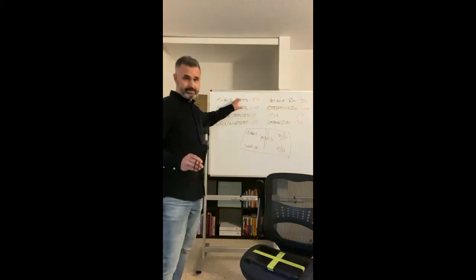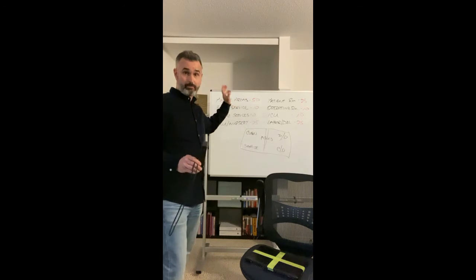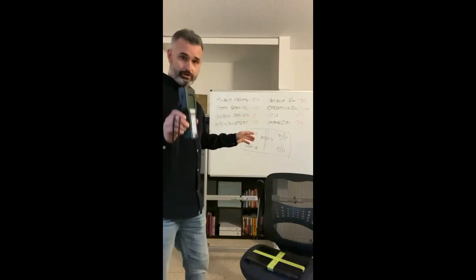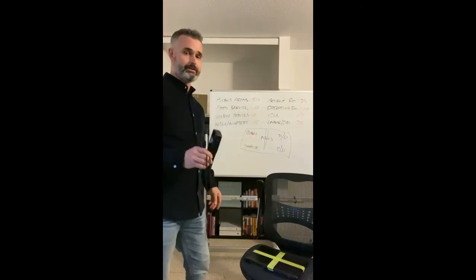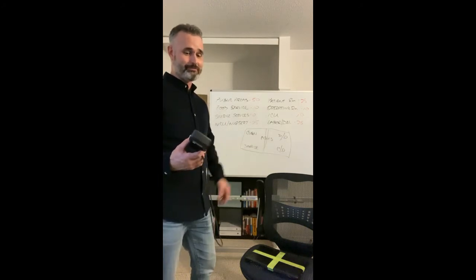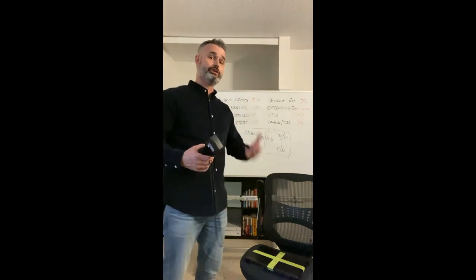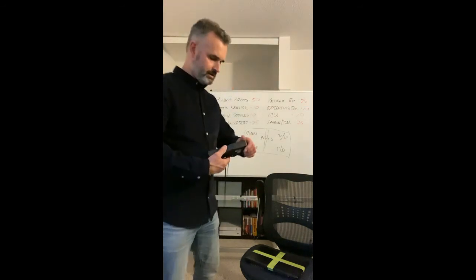So if we go back to here, you can see how if these areas, public areas, are properly cleaned, you can get that down to exactly where it needs to be. Now, obviously, it just happened to fall out of 50. I was pretty fortunate there, but it gives you an idea of how just a good cleaning can actually lower the bacteria count or the bio load that's on that surface.